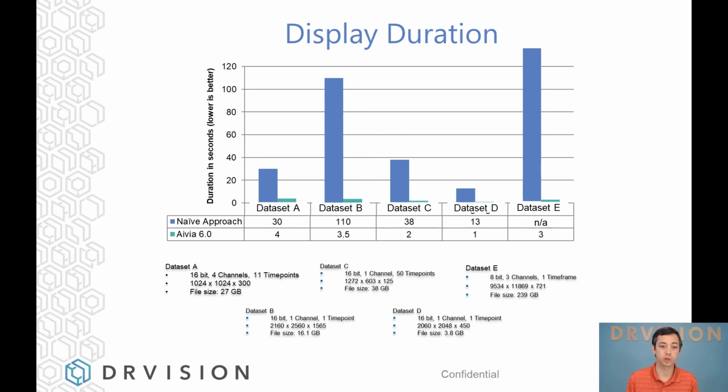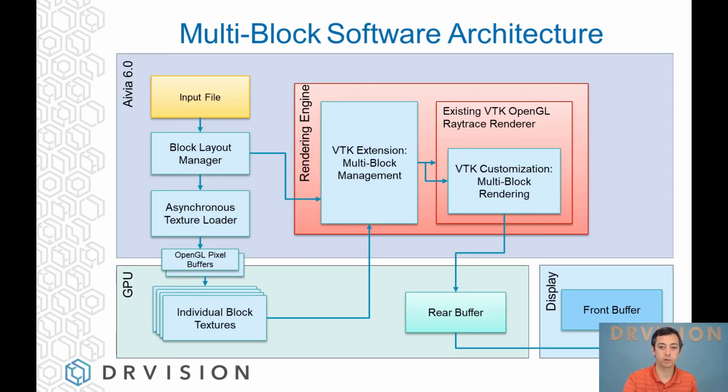But with the new approach, we can render the whole thing and show you the actual details of what you're looking at. So I hope that gave a little bit of background into our rendering engine and the flow of how the data gets off the file on your disk and streams over to the GPU so you can see it without bogging down or being slow.